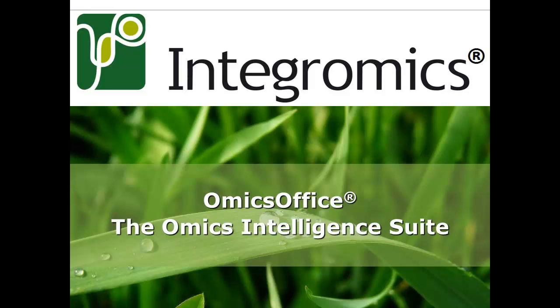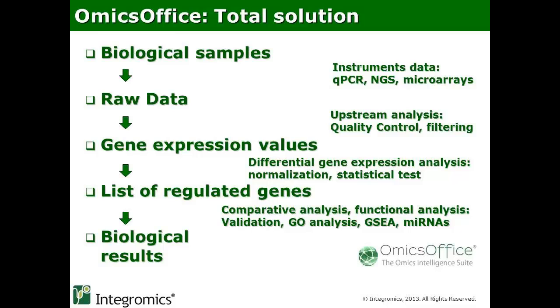OmicsOffice Suite is an application for the analysis of omics data. It runs on the Spotfire platform and is organized as a core set of components available to any OmicsOffice user. Additionally, it comes with a series of vertical workflows that can be added to this core set containing technology-specific workflows. The vertical workflows have the additional capacity to load raw input data from RNA-Seq and ChIP-Seq in the form of aligned reads as well as microarray and qPCR data.